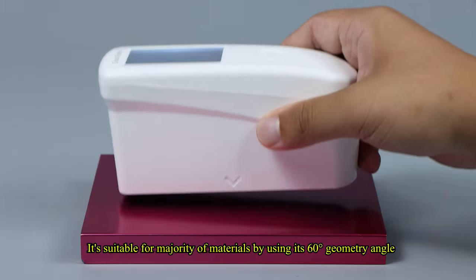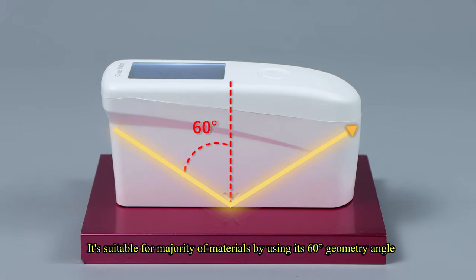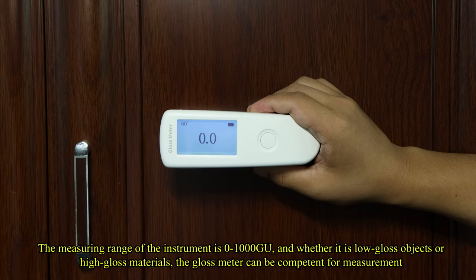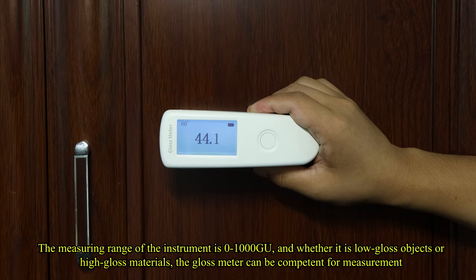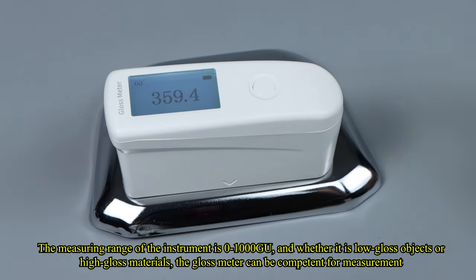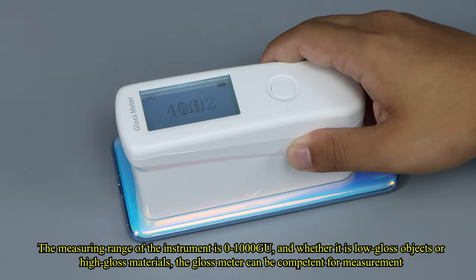It's suitable for majority of materials by using its 60 degrees geometry angle. The measuring range of the instrument is 0-1000 GU, and whether it is low-gloss objects or high-gloss materials, the Gloss Meter can be competent for measurement.